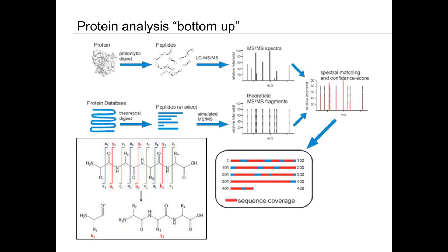So what we are doing is we extract our proteins, perform a proteolytic digest, in general using trypsin, leading to a vast number of peptides that are specifically released from the protein. The next step is then to separate peptides using standard chromatography, in general C18 material, which really nicely works with peptides, in contrast to proteins, where chromatographic separation is often really a problem. And the next step is then MS and MS-MS characterization of these peptides.